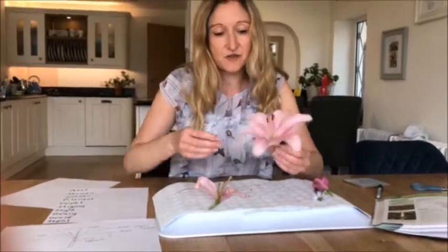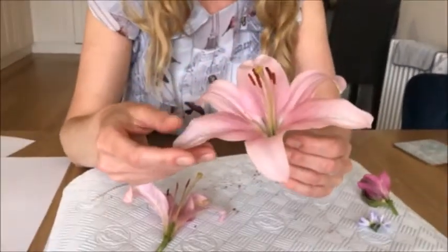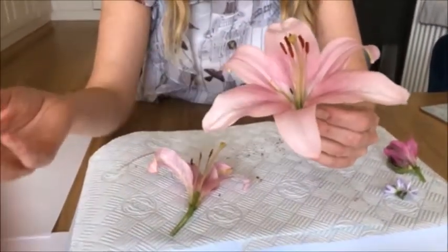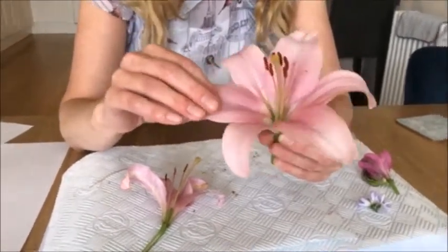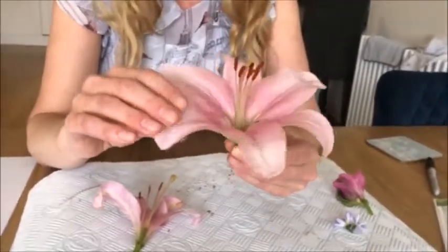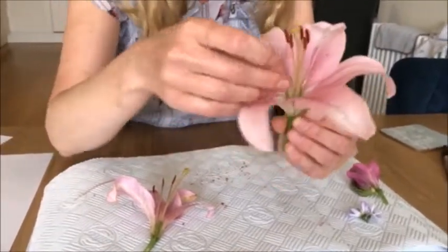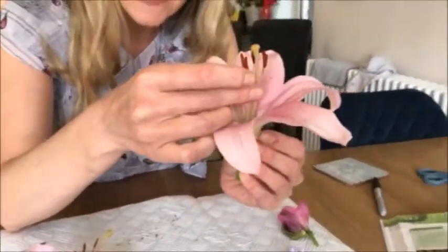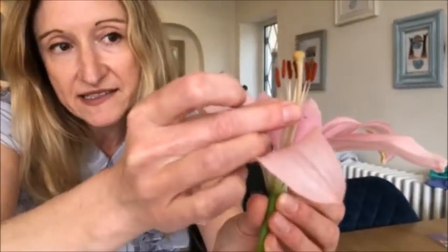So first of all, what we've got are, a bit closer, the petals. And the petals are brightly coloured and they attract insects, which are going to help us with our pollination. So these are the landing pads for our insects. Now what we've got here, and these are very, very distinctive in the lily, are pollen grains.